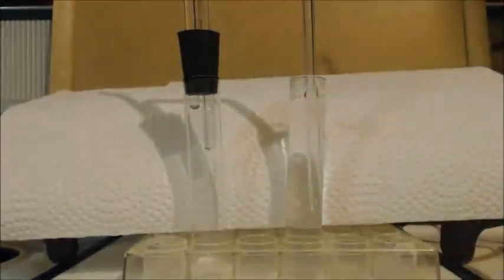On the left there where you've got the stopper, you can see up here, this is a dead end port. This first one, you can see there's two coming out of there. The one on the left is a dead port. The one on the right leads to the other test tube, and it has sodium bromide inside there. Sodium bromide salt, aqueous, meaning it's in water.